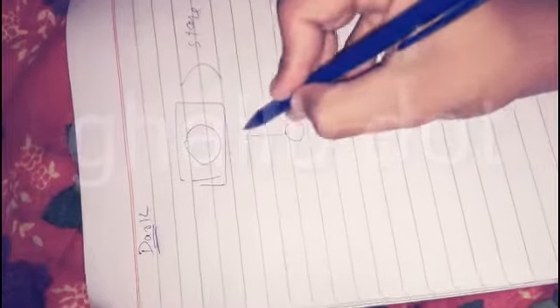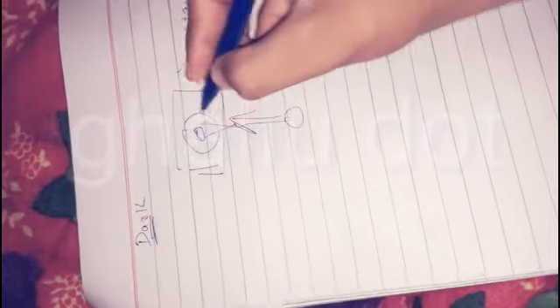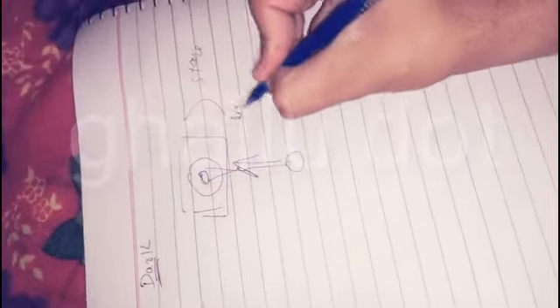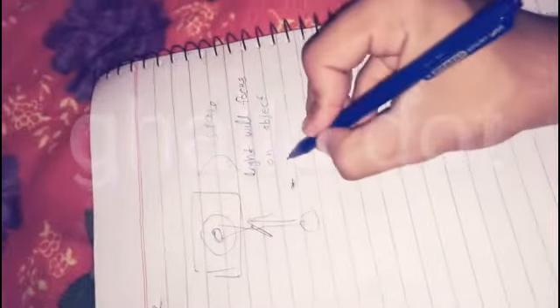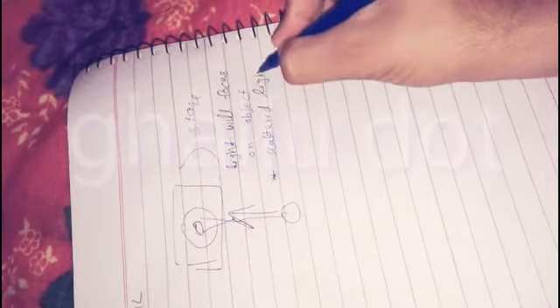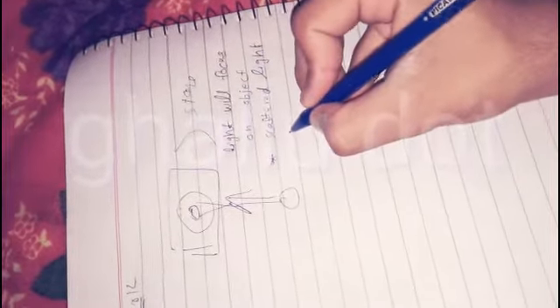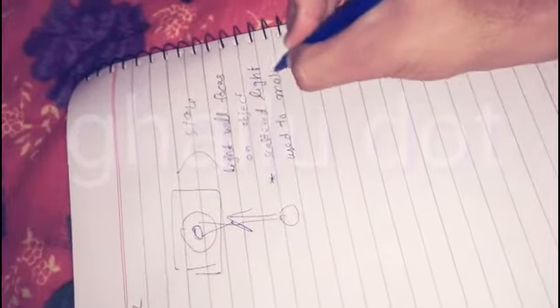Next one is the dark field microscope. Also, I'm going to tell you what that is. This is an object which is placed on the stage. Light will focus only on the object, and the light will scatter. This scattering light is used to make the image, and the other field is dark. The reason is that light is focusing only on the object.